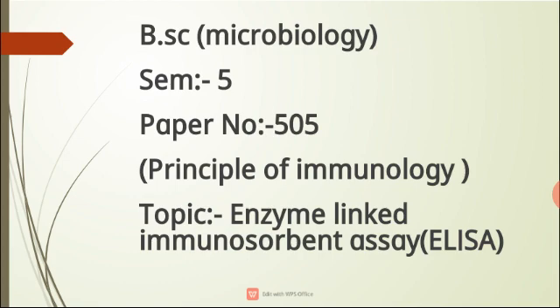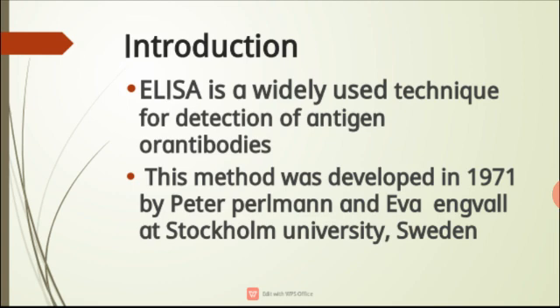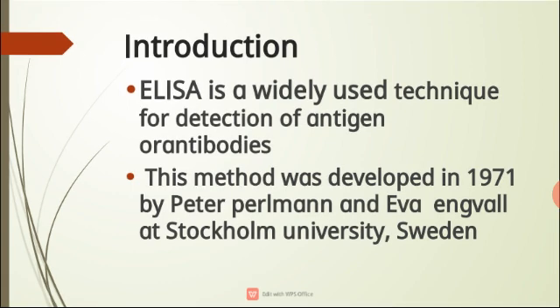Today we discuss the Sem-5 B.Sc topic named Enzyme Linked Immunosorbent Assay. We all know it as ELISA. ELISA is a technique used for detection of antigen or antibody, developed in 1971 by Peter Perlmann and Eva Engvall at Stockholm University, Sweden.